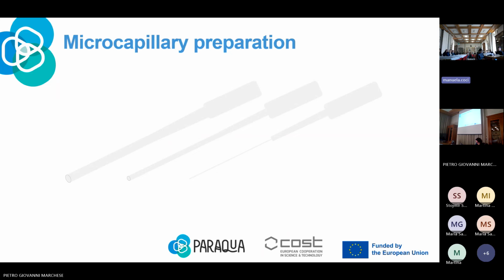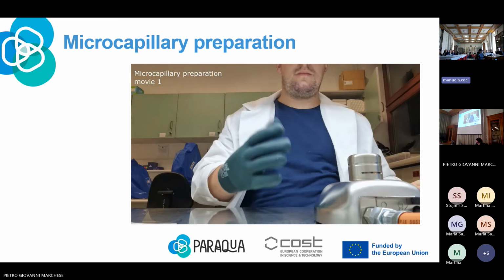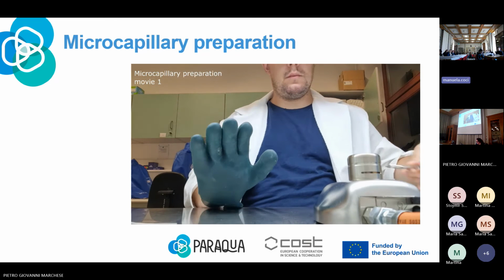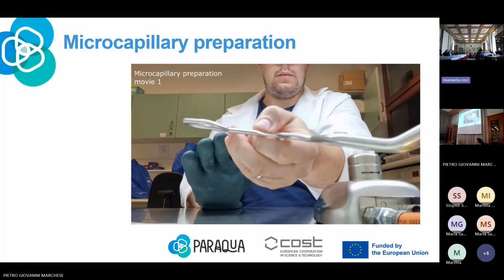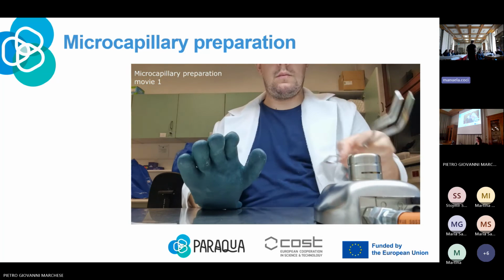Yes, regarding the microcapillary preparation, the best is to use the thinnest possible. We can buy some microcapillaries in lab shops, but if your budget is limited, you can prepare the microcapillaries yourself. Here you can see a short movie that I recorded, showing how to prepare microcapillaries of different sizes.